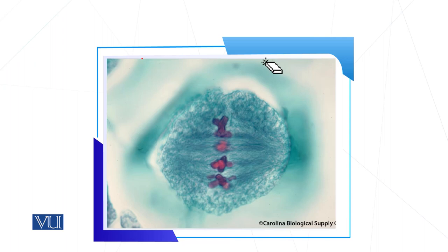Can you identify this next stage? The chromosomes are aligned in the center, so it should be a metaphase. To determine whether it is metaphase 1 or metaphase 2 — in meiosis 2, the sister chromatids are separated. Since there is no movement to opposite poles in this image, it is metaphase 2.